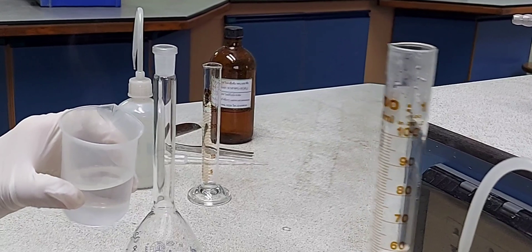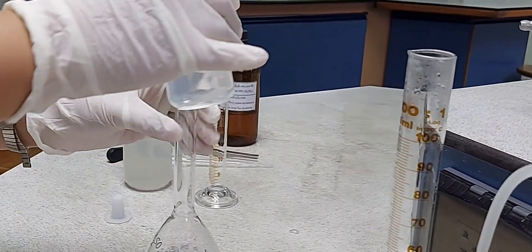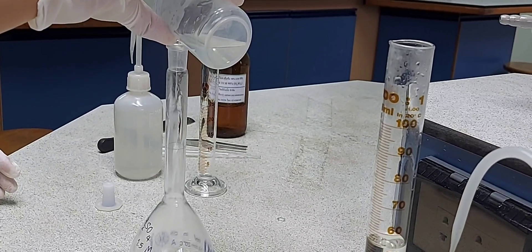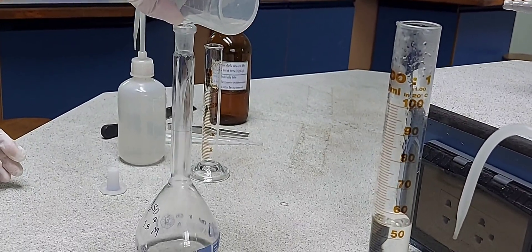So you can see that the 100 ml diluted acid is getting added to the 250 ml graduated flask.